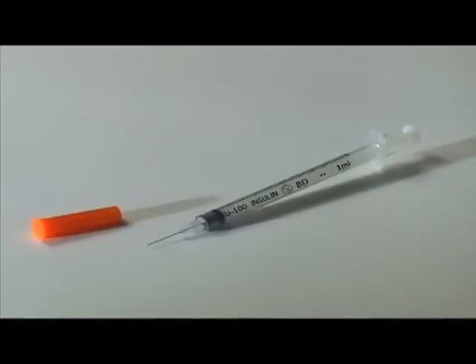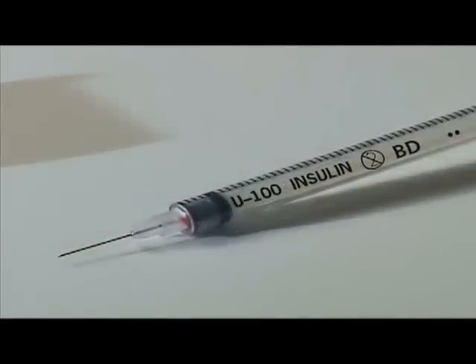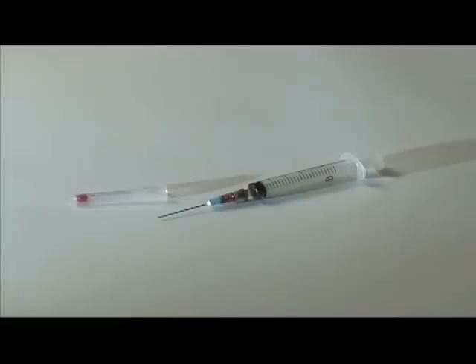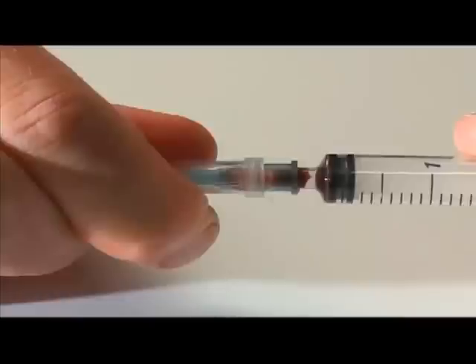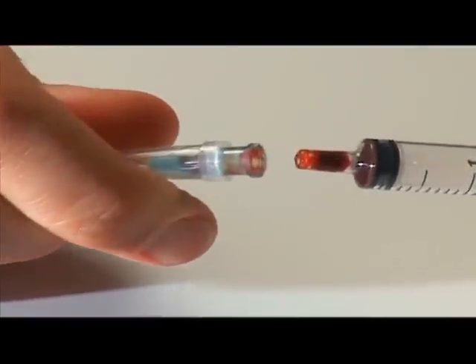We wanted to compare two different kinds of syringes that are in use by drug users. The most common kind that we find in use are insulin syringes with fixed needles that contain only about 2 microliters of blood when the plunger is fully depressed. That's 2 millionths of a liter. The second kind are syringes with detachable needles that can contain 10, 20 or more times more blood because of that void volume where the needle and the syringe attach.